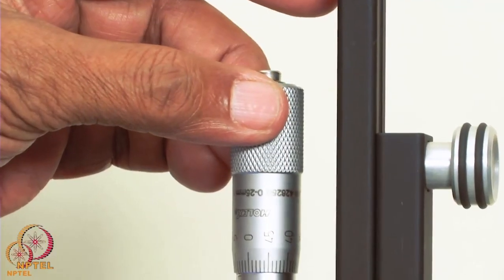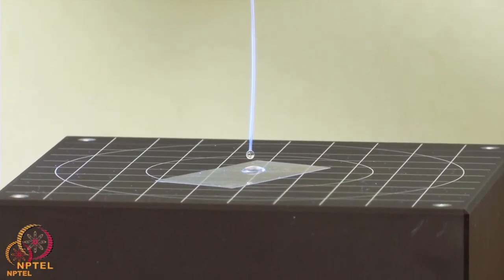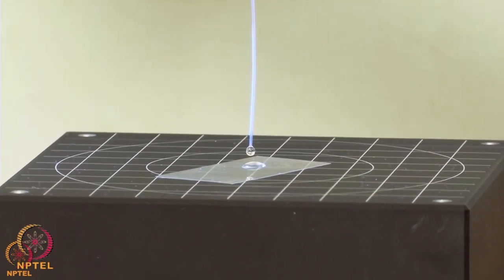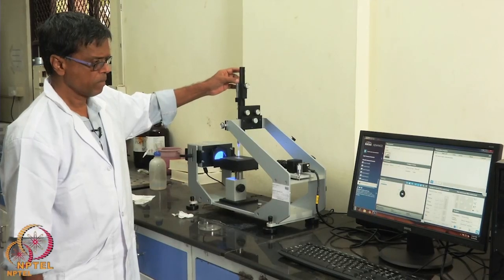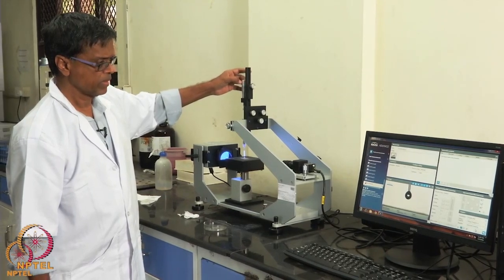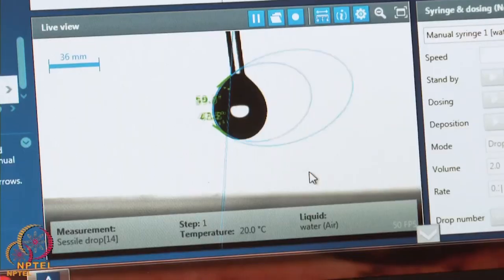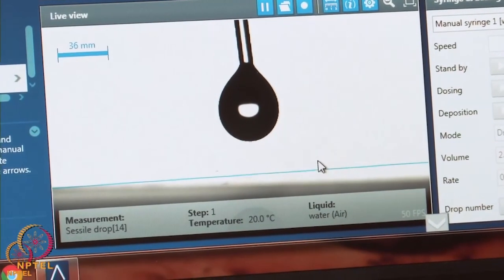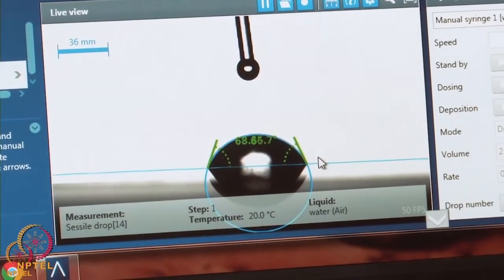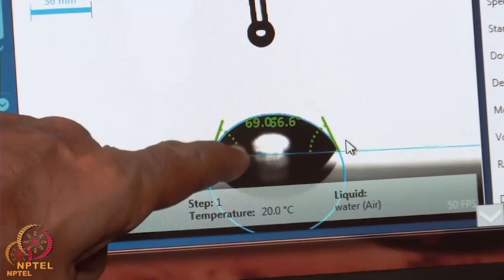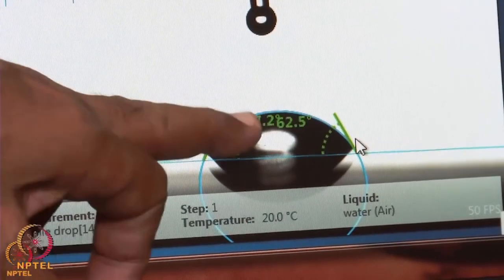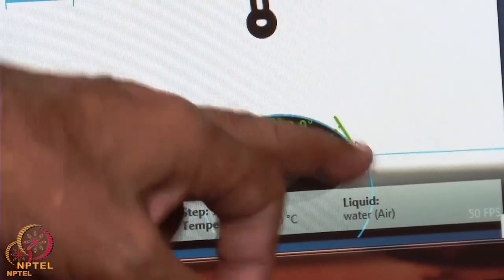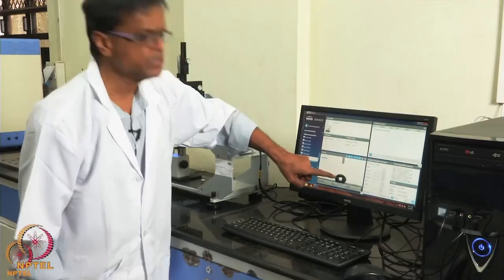I will slowly turn the knob. Can you see the drop there? The drop comes down. You can see the water droplet has settled on the surface. Now the software automatically measures both angles — this is called the receding angle and this is called the advancing angle. Sometimes the receding and advancing angles could be different, and we take an average of that.